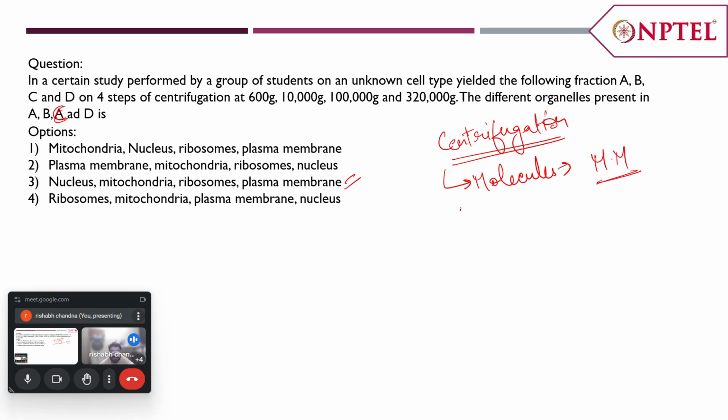In a well or a tube, if we have different molecular mass components, then the heaviest ones would be located in the last row, then the less heavy, followed by the lighter ones. So the lightest would be on the top of the tube, and the heaviest would be on the base of the tube. For example, we have the cesium chloride gradient centrifugation.